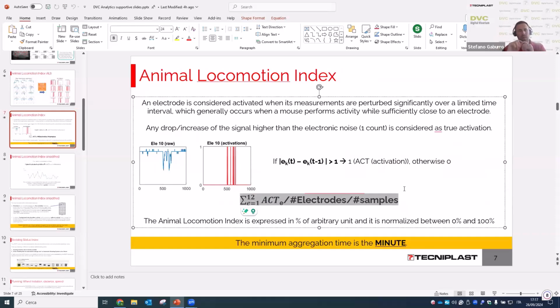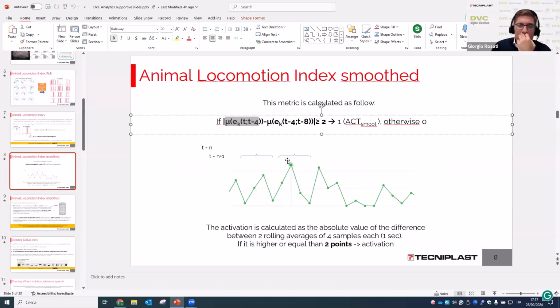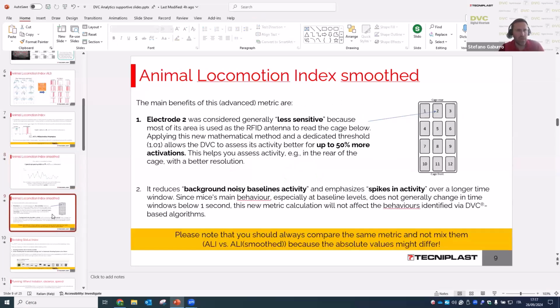instead of having 1 by 1, and that allows us to have a non-integer threshold, which does not have to be 1 or 2, it can also be in between, and is therefore more sensitive and also less noise sensitive. Therefore we suggest that, from the last 3 years onwards, the diagonality, frontality, and everything else is calculated on this parameter. When you download the data, the file is called edge because it was originally called like that, and we will potentially change it at some point in the future. And that's what you would have to look for.